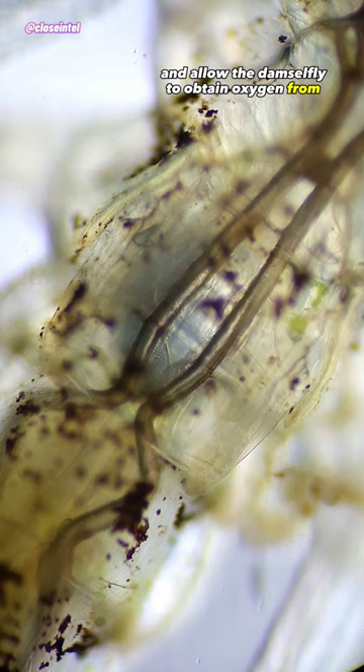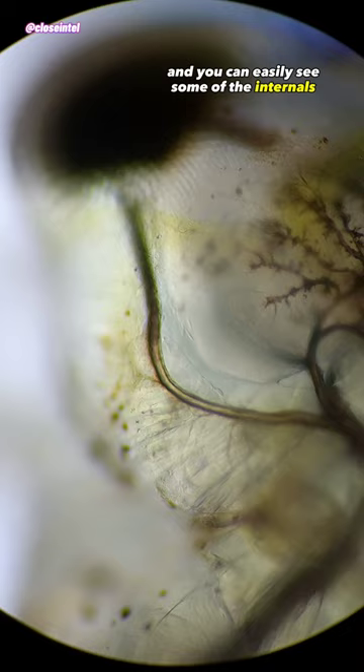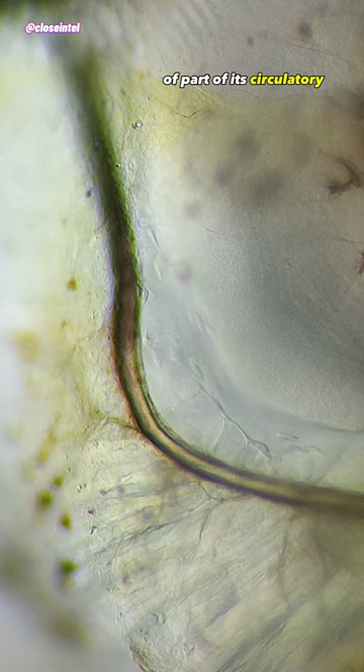The nymphs are somewhat transparent, partly due to the light intensity, and you can easily see some of the internals right here. I was even able to get a shot of part of its circulatory system in action inside of the damselfly's head.